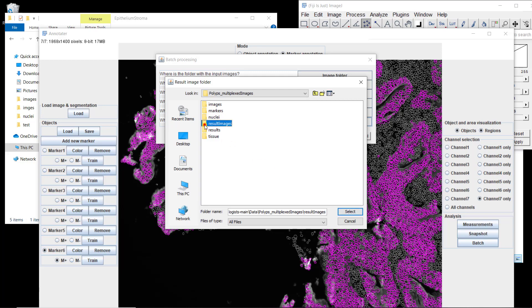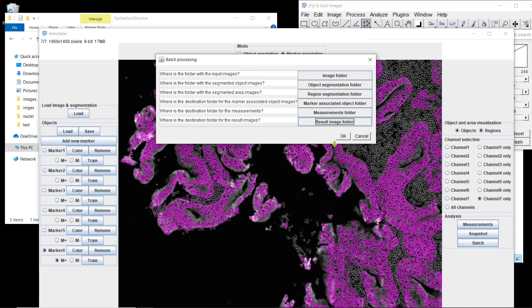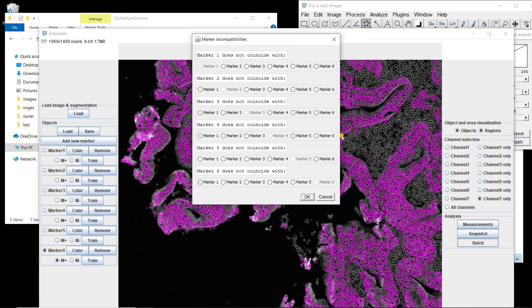If you know that some markers cannot co-occur, you can tell the algorithm not to combine them. For example, cells positive for CD4 cannot also be positive for cytokeratin, same for CD8, same for T-bet. So I'll specify that marker 6 (cytokeratin) does not coincide with marker 1 (T-bet), marker 2 (CD8), and marker 4 (CD4), to avoid biologically impossible cell type assignments.